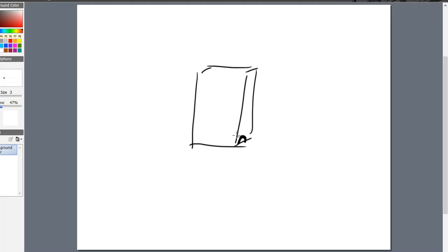And that hump creates a trough area in the front and another trough area toward the back. If I look at it from the side, which is probably a better view, that hump is right here in the middle. So I get a small well on the front side of the tank and a small well on the back side. That is there for a reason, and we're getting ready to talk about that reason.